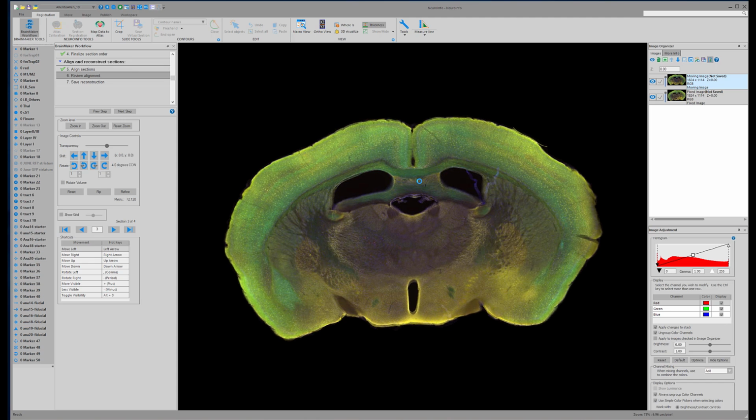So Chip, as you're doing this, I think we found your sections are spaced at what, 80 microns apart? These sections are actually all done at 50 microns. They're at 50 microns. Yep. So these are 50 micron sections, and go one to the next.